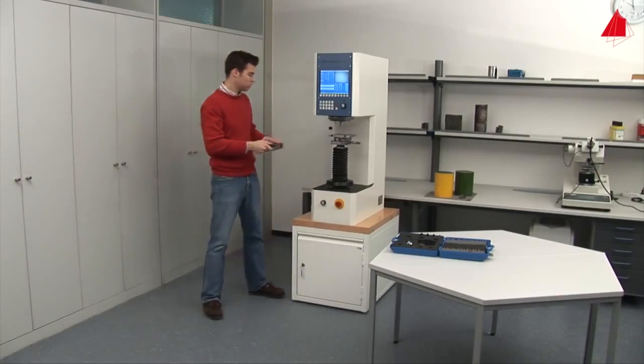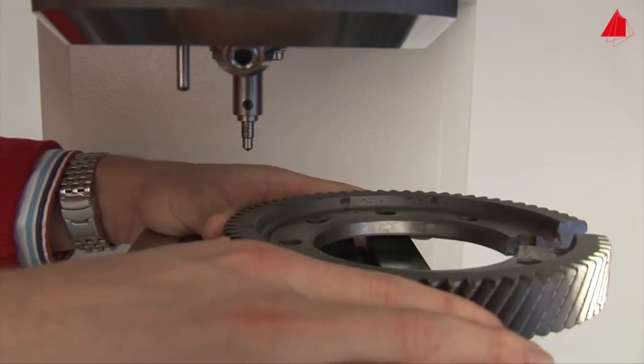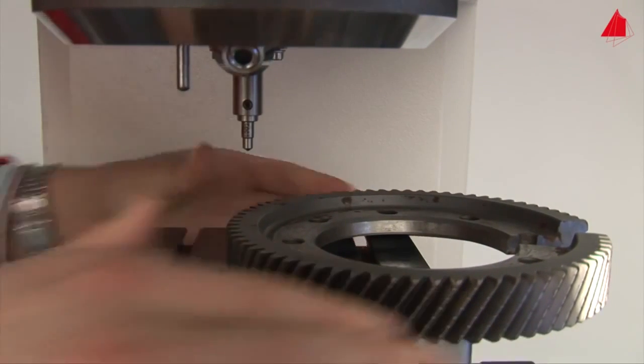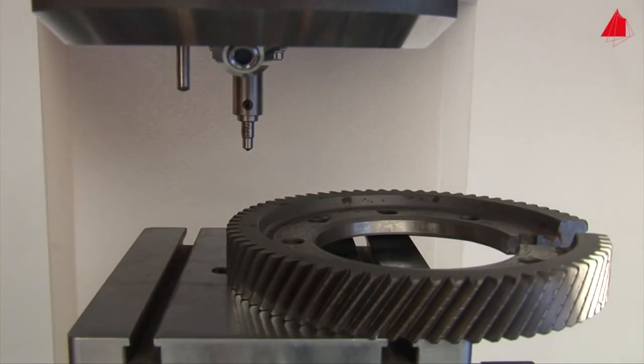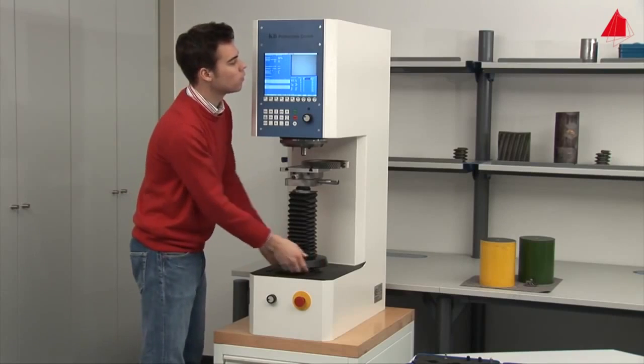Then he picks up the gear wheel and puts it on the support table. After rotating the microscope lens to its vertical position, he can adjust his test piece. As soon as a focused image can be seen on the screen, the surface of the test piece is at the correct height.